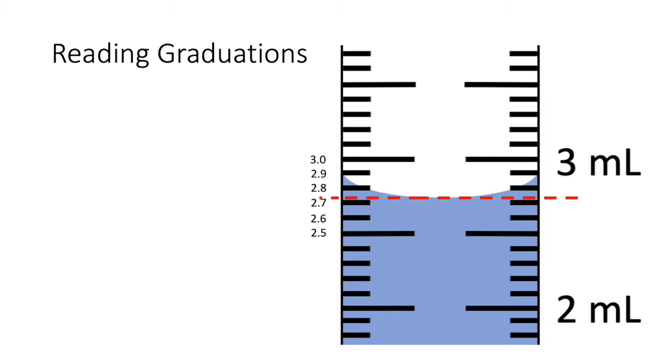And in general, you can estimate a reading to one-fifth the magnitude of a graduation. So in this case, our graduations are 0.1 milliliters, and one-fifth of that is 0.02 milliliters. So we can read to the nearest 0.02 milliliters.